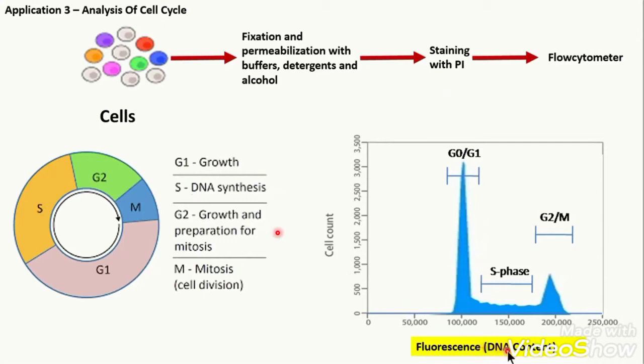But I can divide them according to DNA content if we are talking about human DNA. So in human cells, in G1 cells, the DNA content will be 46 DNA molecules. In G2 and M, it will be 92 because replication makes them double. And in S phase, there will be between 46 to 92 because the replication is occurring. So I can divide the complete cell division based on DNA content into 3 parts. G1 phase, 46 DNA molecules. G2 phase, 92 DNA molecules. And S phase, between 46 and 92, it can be anything.